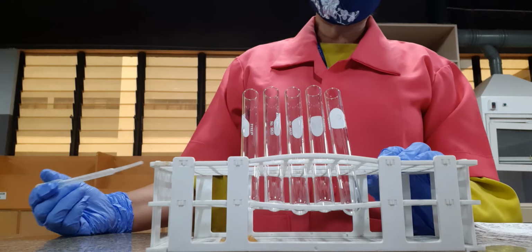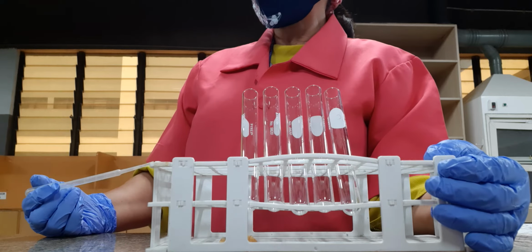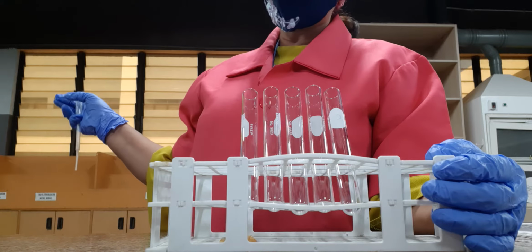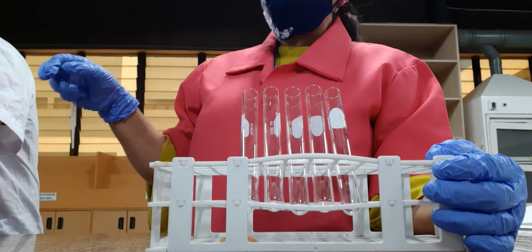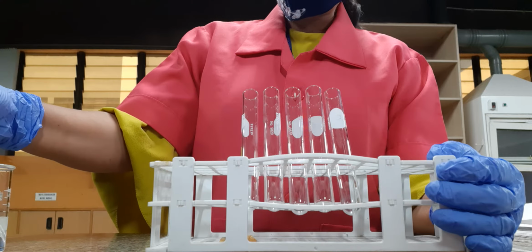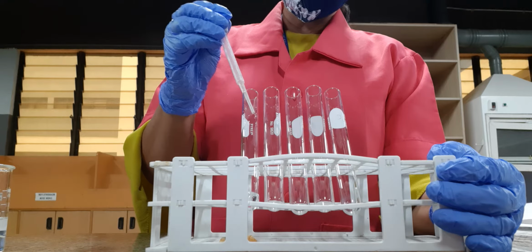So we will have 1 ml of each of these: formaldehyde, acetaldehyde, acetone, benzaldehyde, and acetophenone, or what we call methyl phenyl ketone.